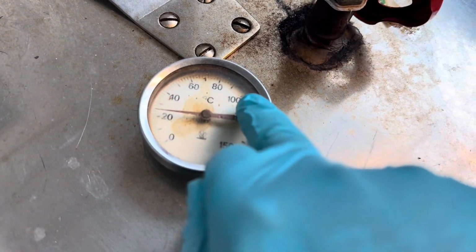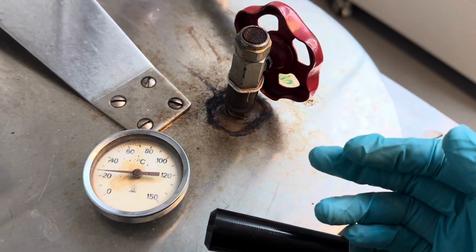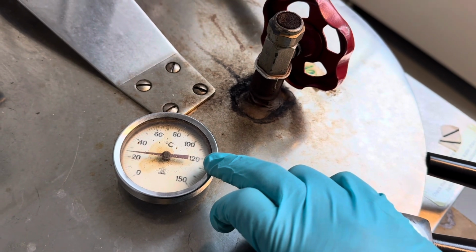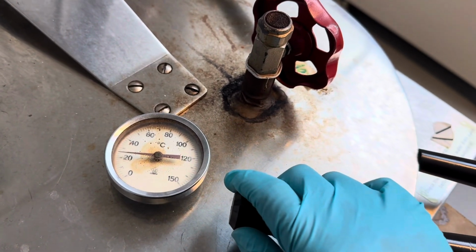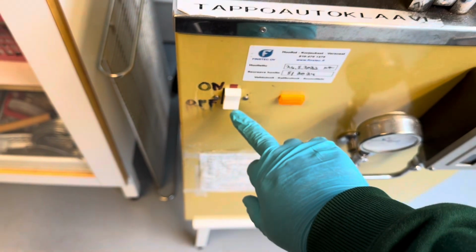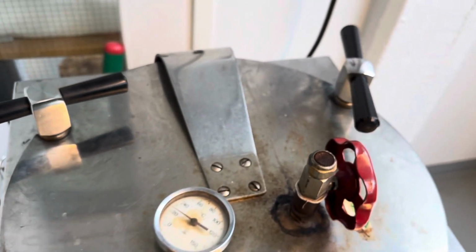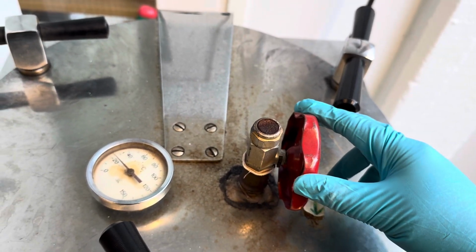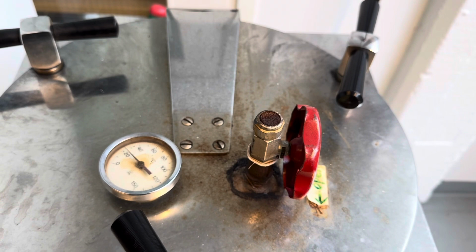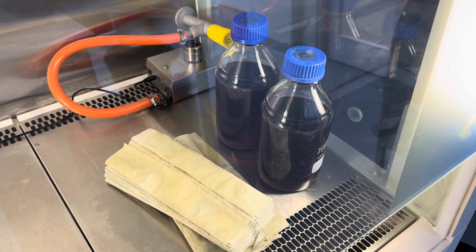When the temperature reaches 100 degrees, I will close the valve so that the pressure inside the chamber will elevate, and until the needle goes to 120 or 122 degrees, I will let it run for at least 15 to 20 minutes. Then I will turn off this button and wait for around 15 minutes, and then I will slowly open this valve again so that the hot air is released from the chamber.